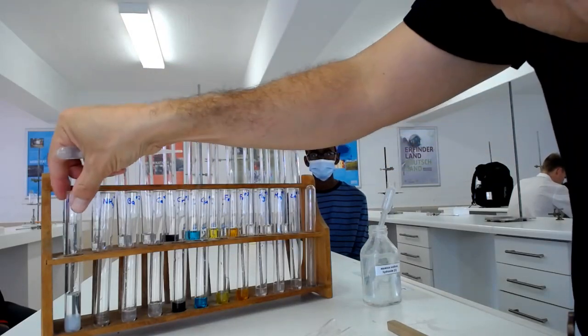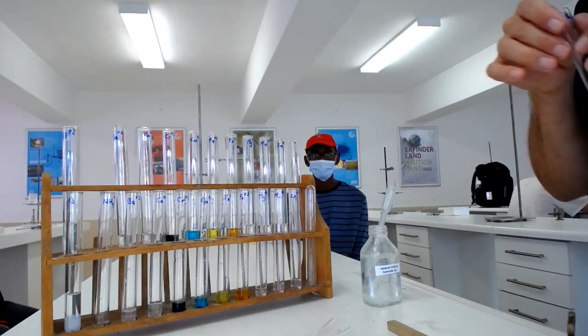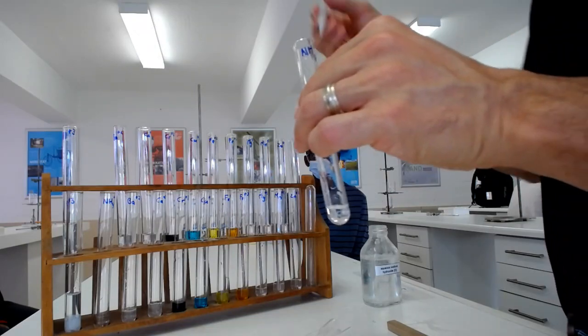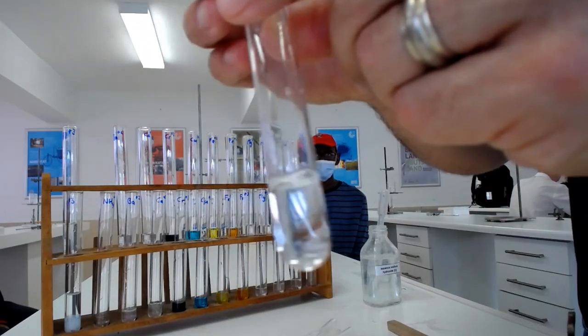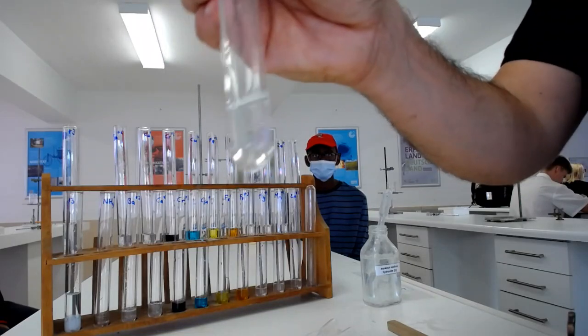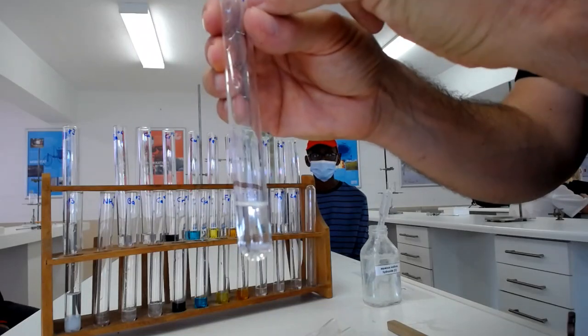Done. Next one, ammonium. What happens with ammonium? There's no precipitate with sodium hydroxide. There's also no test with ammonia. But what it does tell you is that when heated, it gives off ammonia. So this is your ammonium ion that gives off ammonia.